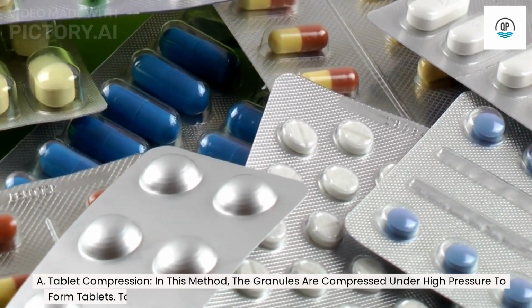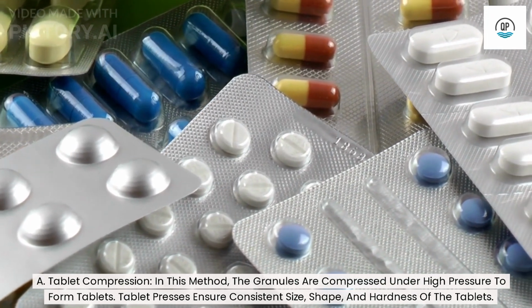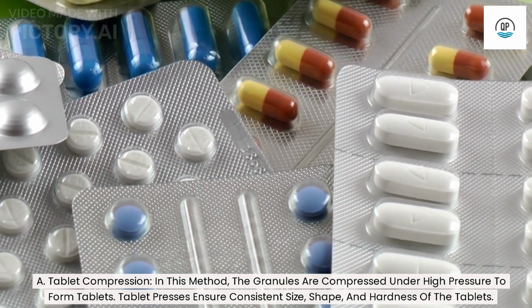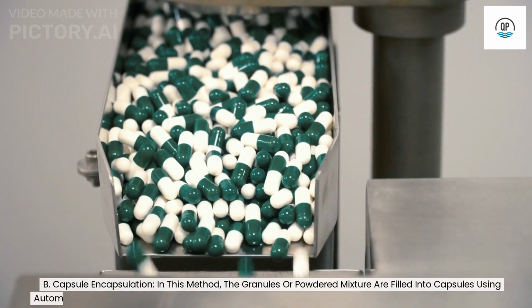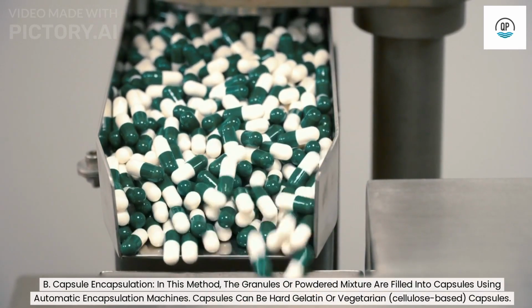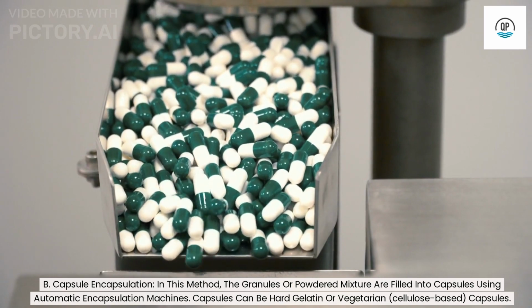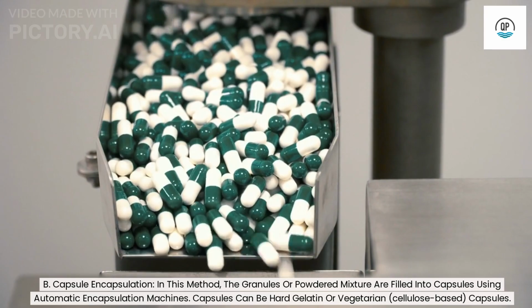A. Tablet compression. In this method, the granules are compressed under high pressure to form tablets. Tablet presses ensure consistent size, shape, and hardness of the tablets. B. Capsule encapsulation. In this method, the granules or powdered mixture are filled into capsules using automatic encapsulation machines. Capsules can be hard gelatin or vegetarian, cellulose-based capsules.